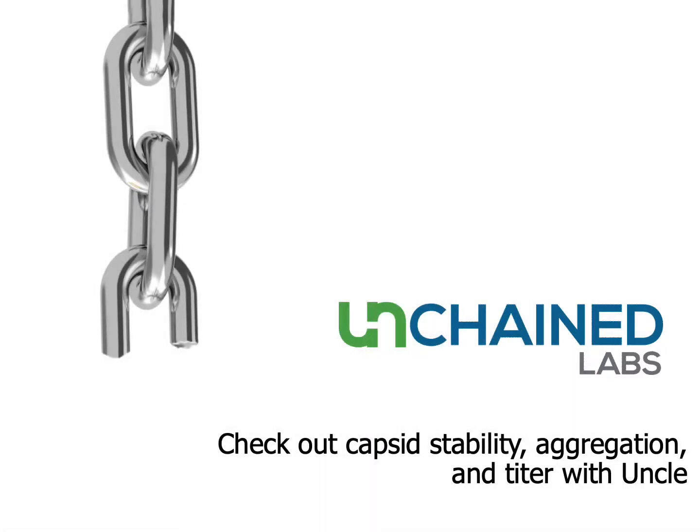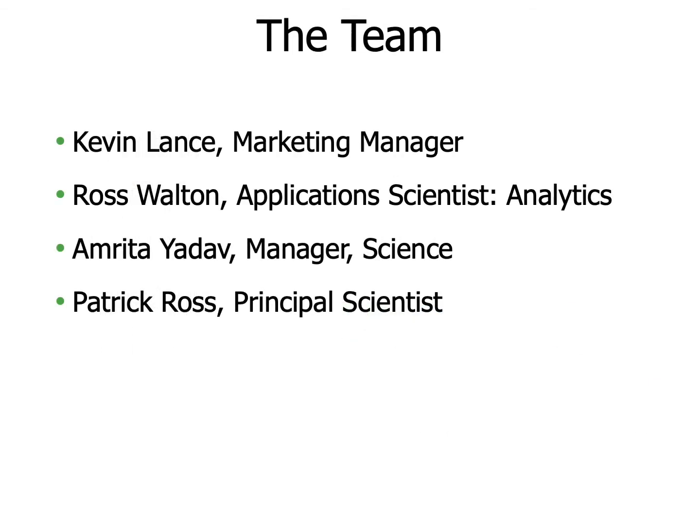Let's check out capsid stability, aggregation, and titer with Uncle. I'm Kevin, and I'd like to thank the team that helped put this presentation together, Ross, Amrita, and Patrick.